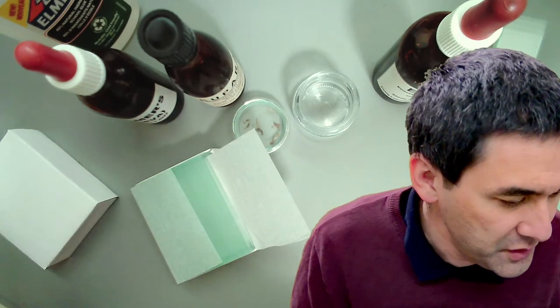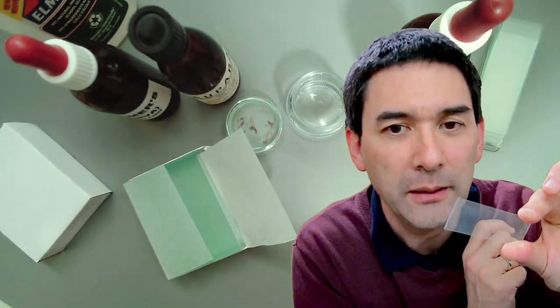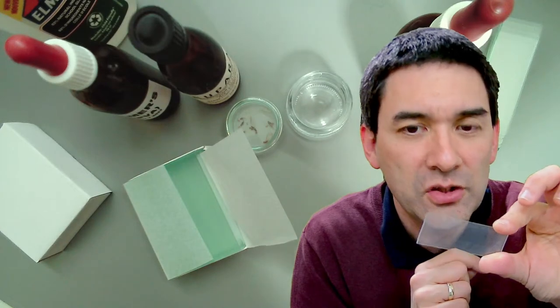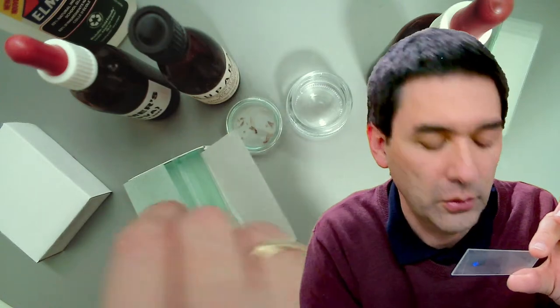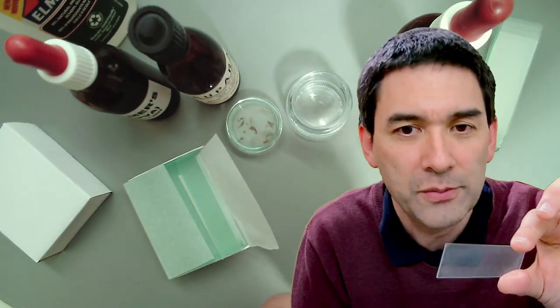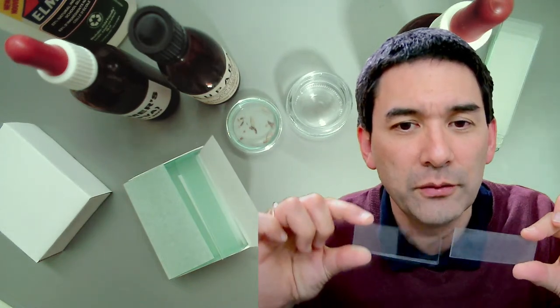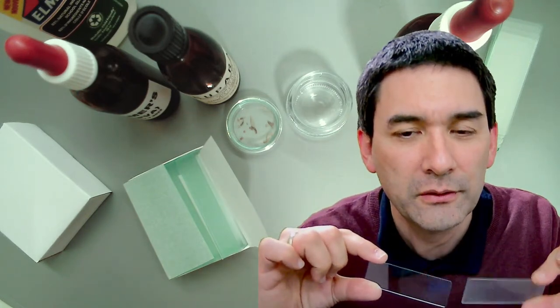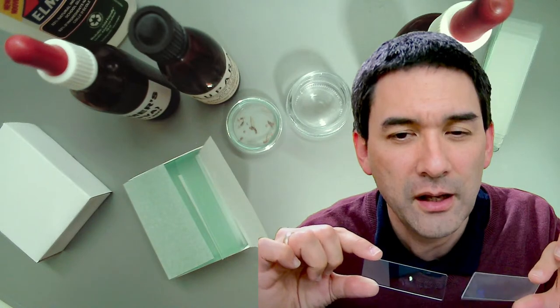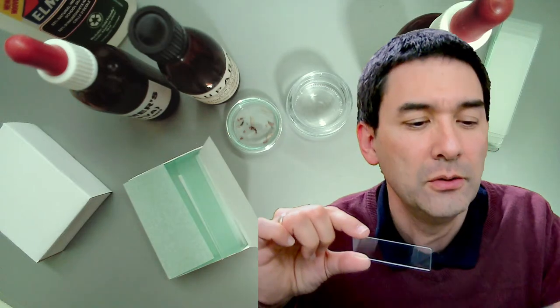Normally, I mean, I've got some others here over there. Where are they? The one here. They're totally dirty. I don't know if you're able to see. Are you able to see it in the reflection, that it looks so white? Yeah, there is a real layer of, I don't know, calcium carbonate or some kind of water spots on, really difficult. And these are the quality ones. Look, are you able to see it in the reflections a little bit? Okay, me in front of my sweater, right? This one over here, it looks like it's covered in a white film or something, and this one is the clean one. Yeah, there's a huge difference.